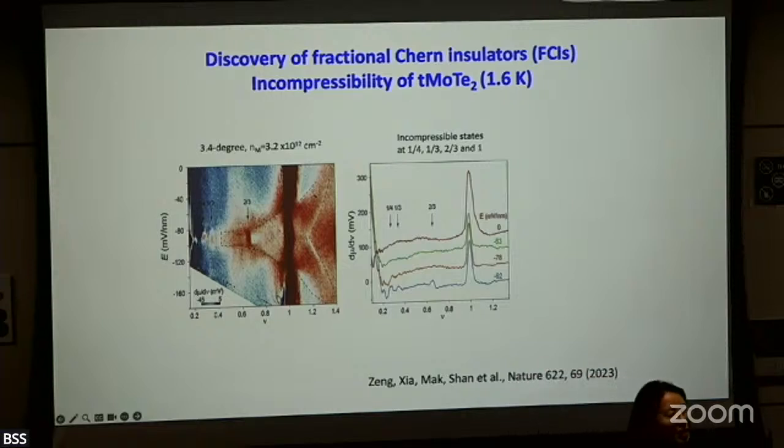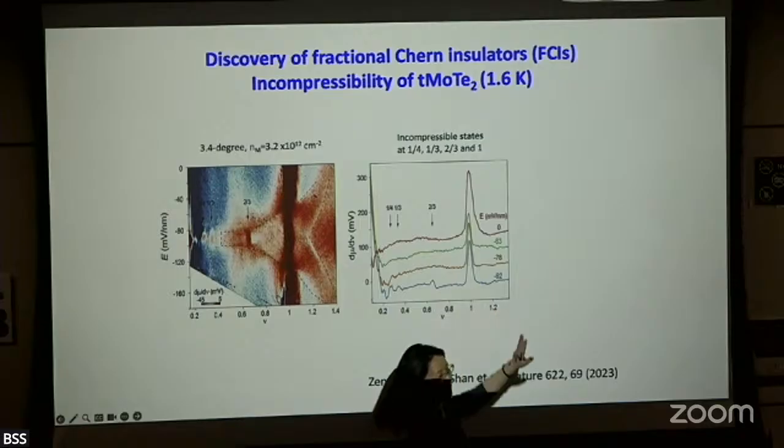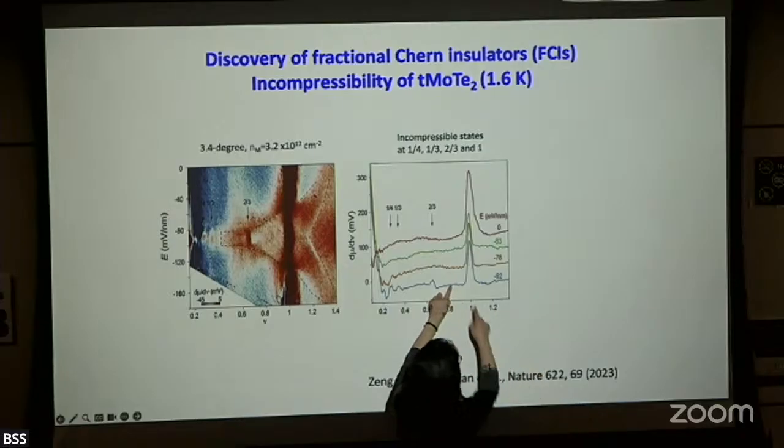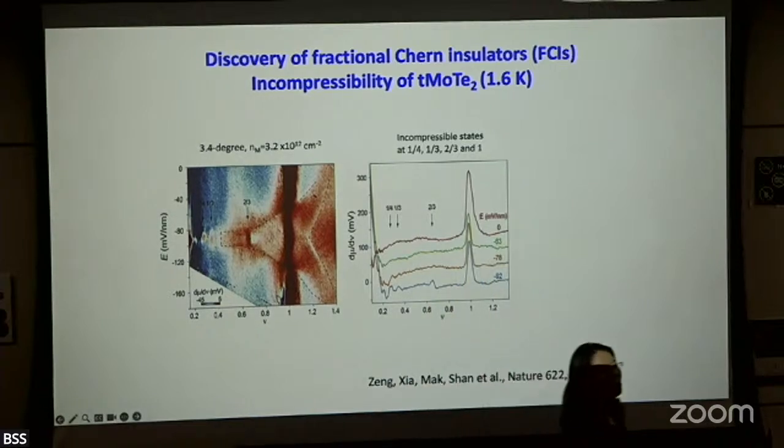Yeah. So this is again related to the background. If the signal is large enough, you will see that step, and you just take that step, when the state is narrow in terms of doping. Experimentally there's always some uncertainty, right? So for example, here we can use this as background, and the area of this peak will be the charge gap size.